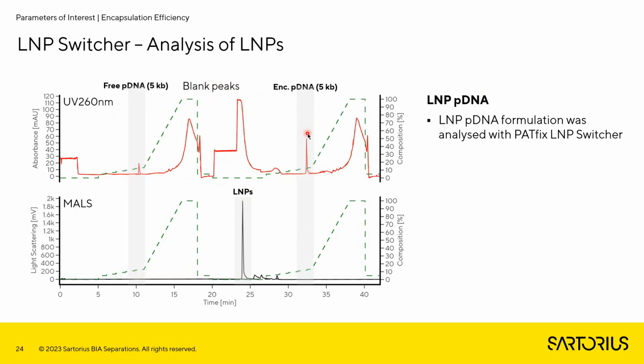Quite a similar situation when pDNA LNP was analyzed using our LNP switcher. Nice peak representing free pDNA, nice peak representing encapsulated pDNA, and also quite a nice response in the MALS detector.